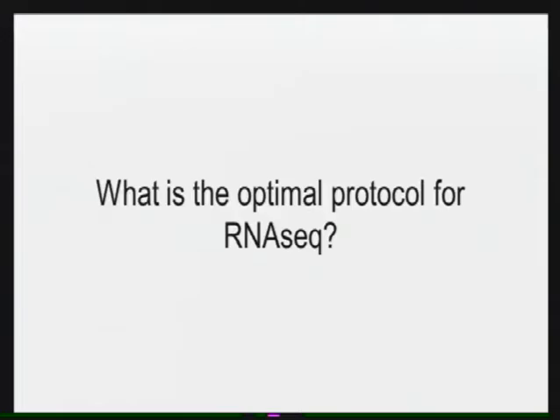Make a mental note. I wanted to talk for a minute about the optimal protocol for RNA-seq. I'm sure if you're all from different places and you had samples, everybody's going to have their samples prepared and processed differently. And it depends on who your collaborators are, or what methods you want to choose, or what tools you have available to you. So I wanted to talk for a minute about how we make those choices.